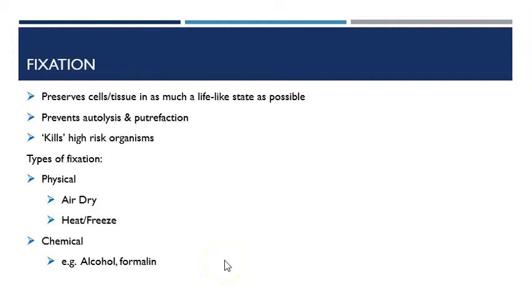So when we're dealing with histology, we tend to do formalin fixed paraffin embedded tissues, where a lump of tissue is fixed in formalin, paraffin embedded and sectioned, and those are preserved for a very long period of time. The alternative is a fresh frozen sample, where the samples are snap frozen in liquid nitrogen and then sectioned as fresh sections, but those sections have to be kept frozen until they are in some way fixed in the first stages of staining, and that fixation step is often alcohol.